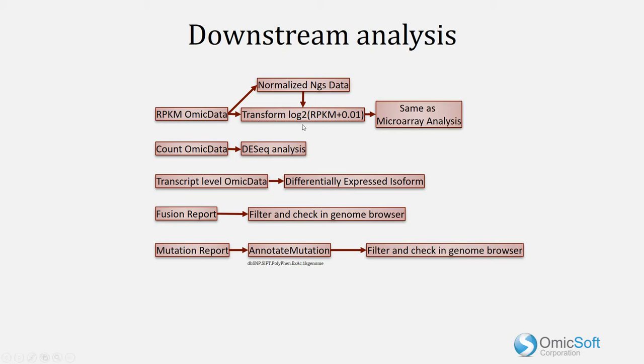Additional information about the expectations of each module for transformation of the data can be found by clicking on the Help button in each module.